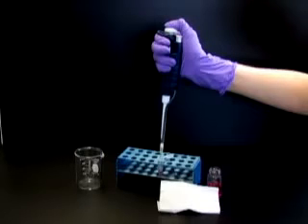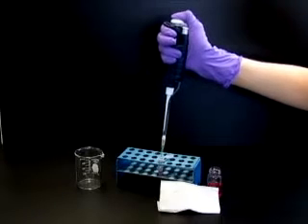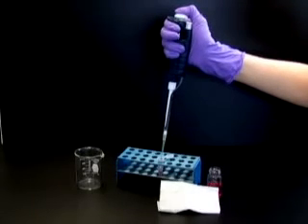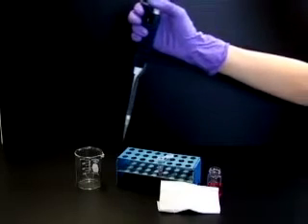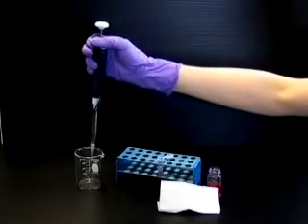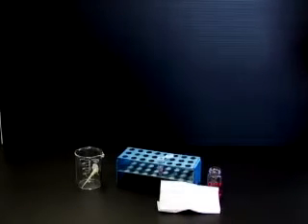With the plunger fully depressed, carefully remove the tip from the container by sliding it up the container wall. The importance of sliding the tip along the wall increases as the volumes become smaller. Finally, allow the plunger to return to the up position. If you are done working with a particular sample, press the tip ejector button to release the tip into the proper waste receptacle. Several other guidelines will help to ensure accuracy and precision when transferring liquids.